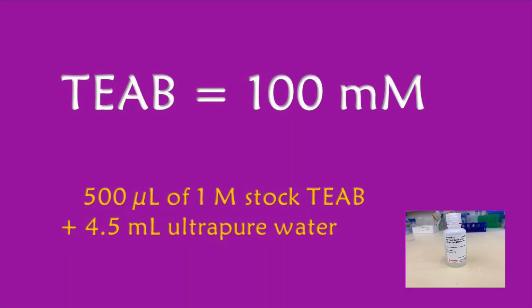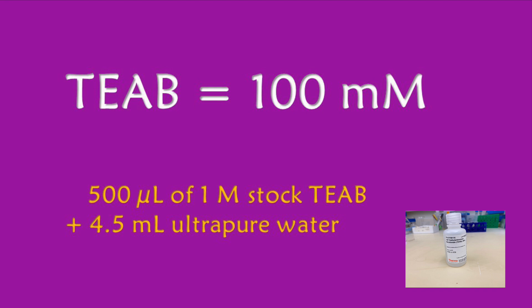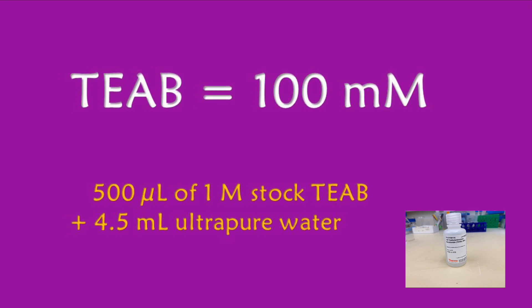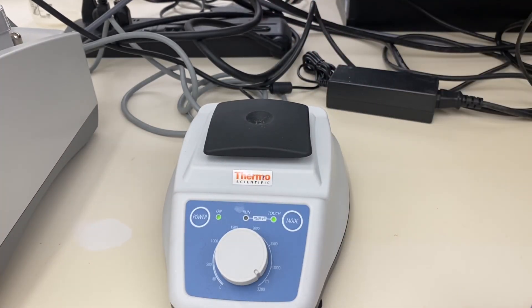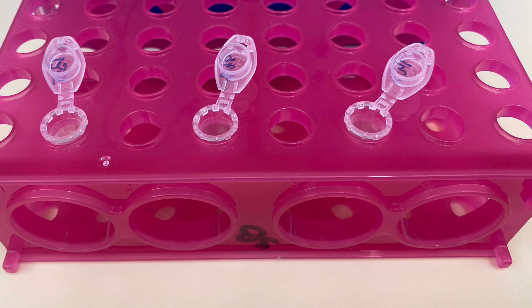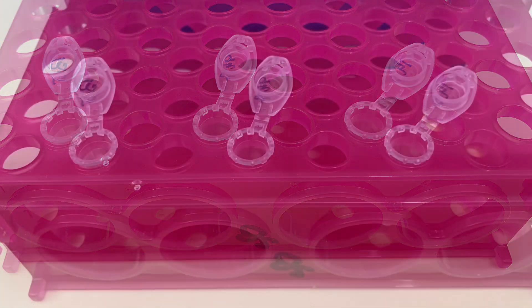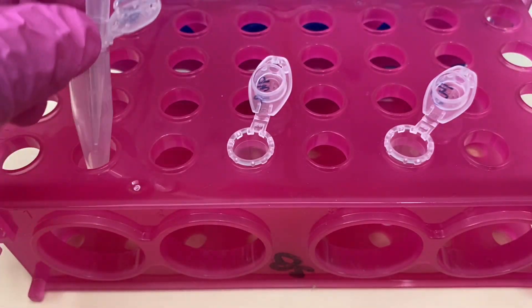TEAB buffer comes as one molar, and for my experiment I'm going to need 100 millimolar, and this is how I'm making it. So I'm going to vortex briefly the buffer and then I'm adding into the clean eppendorf tubes 95 microliters.